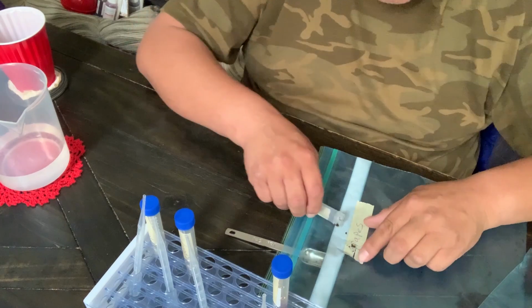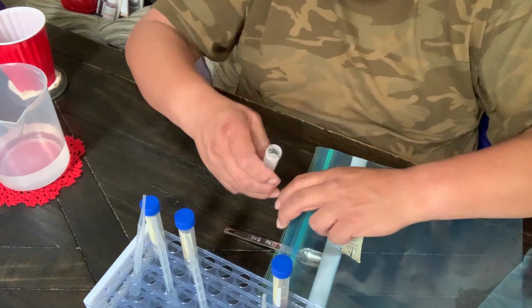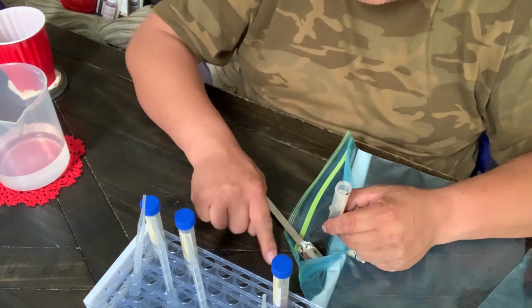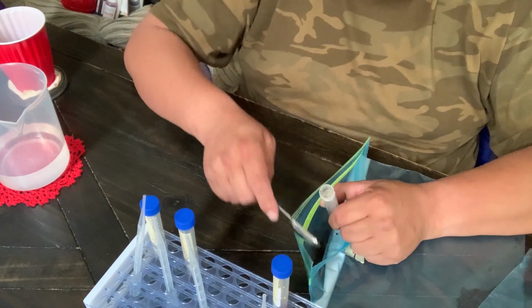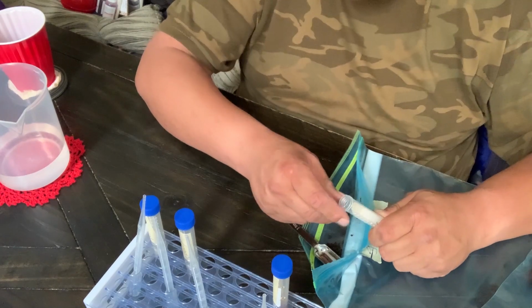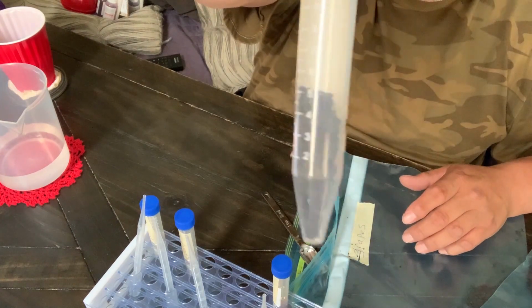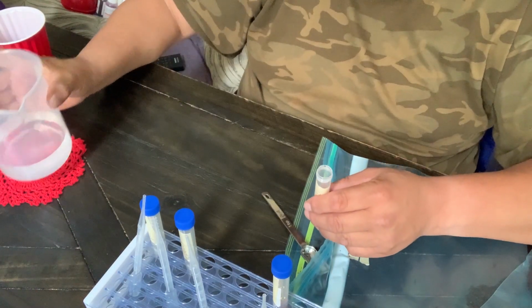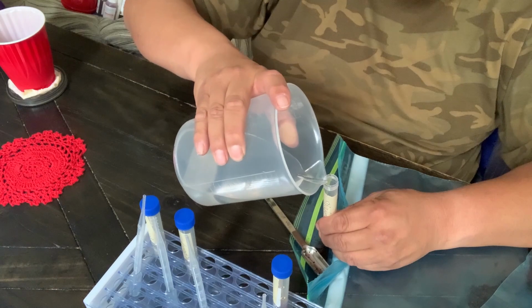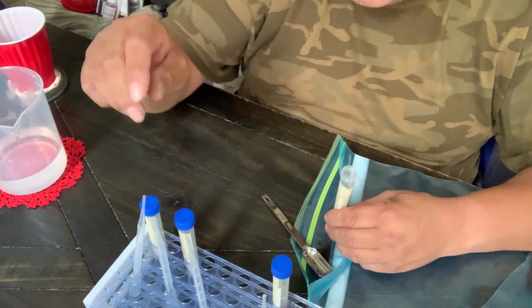Okay. And already making a mess here. So, clean this up a little. There. All right, there's our sample. Again, we don't need a lot, so now we're gonna fill it up with water. Well, not fill it up, but put enough water in there so we can shake it.